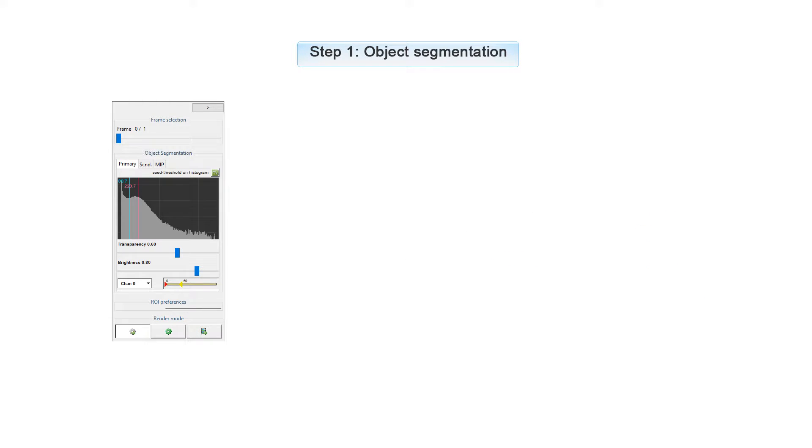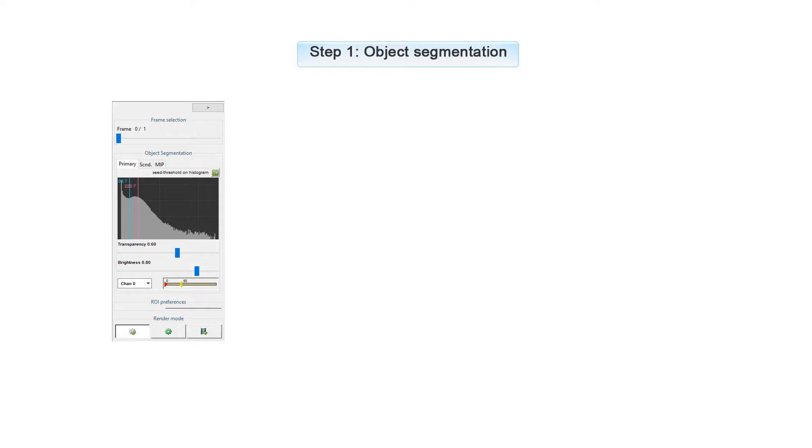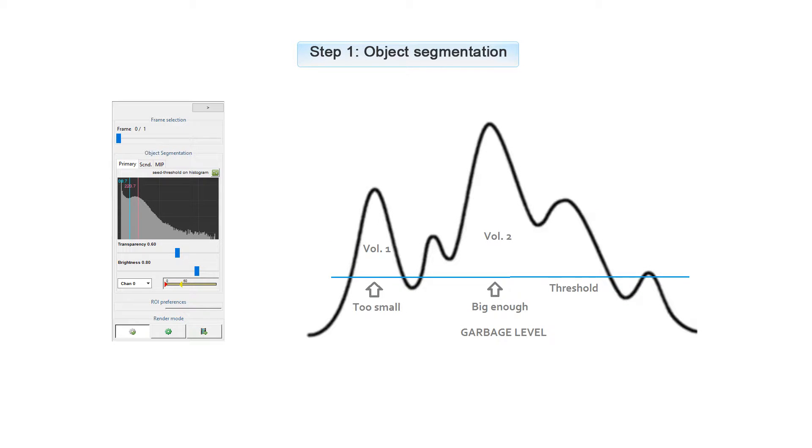You can also use the seed line. Then the analysis will only include the objects that are above the threshold and the seed line. You can also use a garbage level, which only includes objects that are above a certain volume.